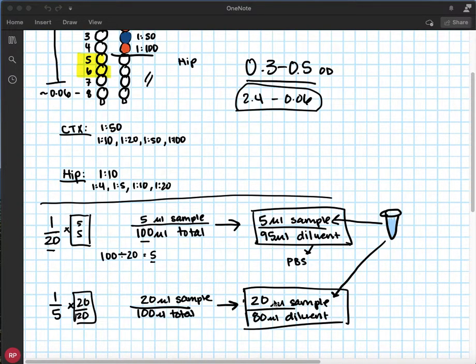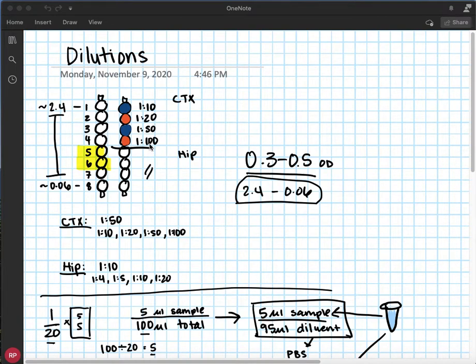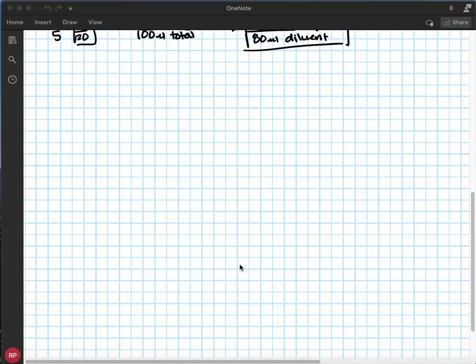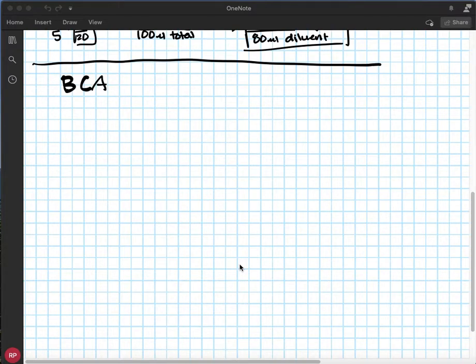So, as long as your dilution, you'll want to do dilutions for all of these that you've picked up before, I guess these over here. You want to do dilutions out just to see what works the best, what lies within the range at a comfortable position. So now we'll be talking about further diluting if you need to get something to a 1 to 300. So for a BCA analysis, I'll usually go from like a 1 to 100, 1 to 200, 1 to 300, 1 to 400 for my test dilutions to see what will be a comfortable OD value.